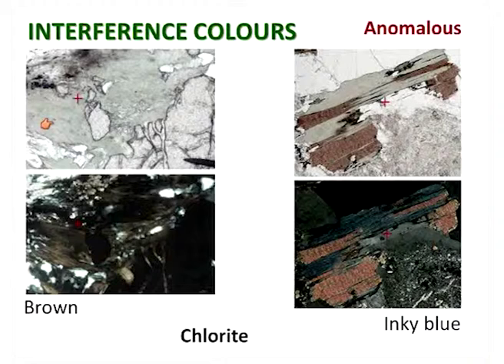Pale green colour, if you use the eye of faith, and that is breaking down the garnet on the right-hand side here. And the interference colours of the chlorite in this case are a kind of horrible, inky, murky brown. And you can see from the way that they are a kind of felted mass that they are very, very different from the kind of standard interference colours you'd expect.